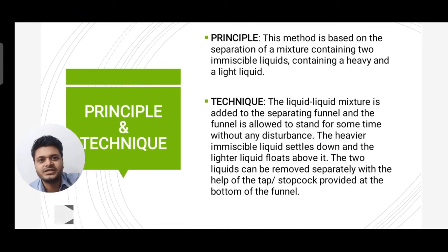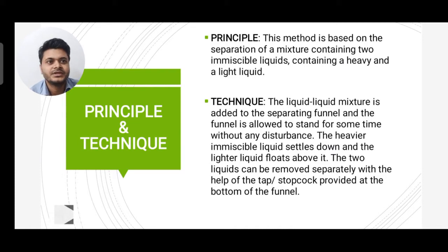Now let's see its principle and technique. This method is based on the separation of a mixture containing two immiscible liquids, a heavy and a light liquid. So what is the technique, how to do it? The liquid mixture is added to the separating funnel and the funnel is allowed to stand for some time without any disturbance. The heavier immiscible liquid settles down and the lighter liquid floats above it.